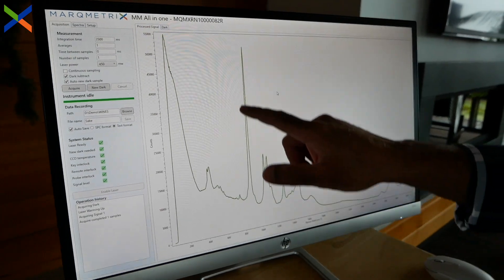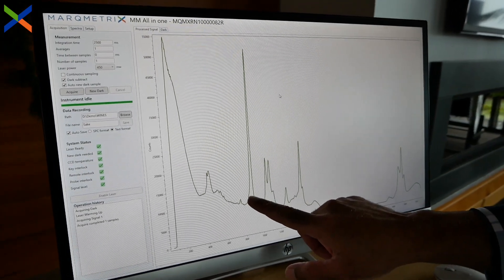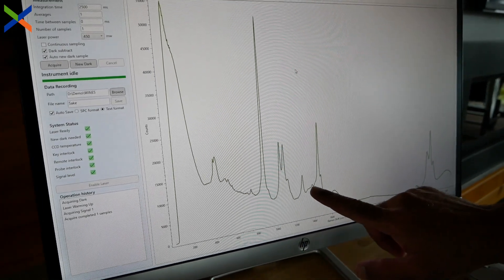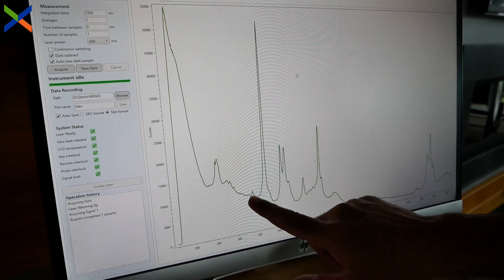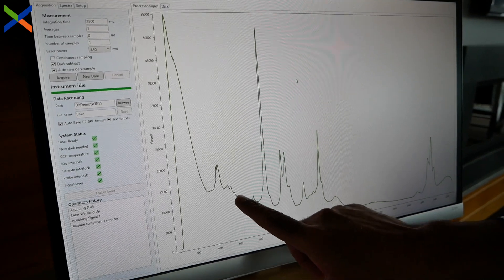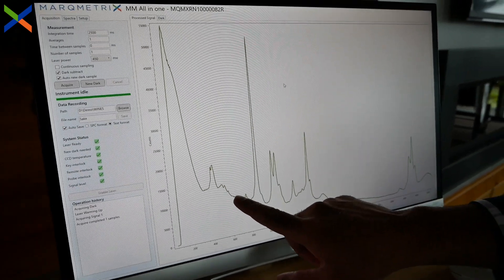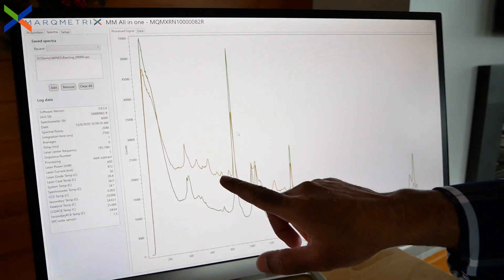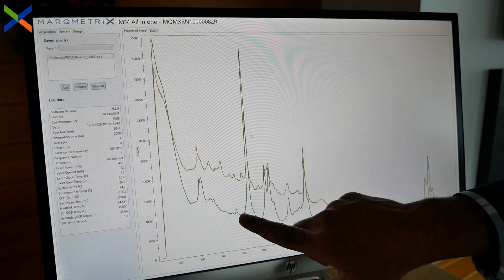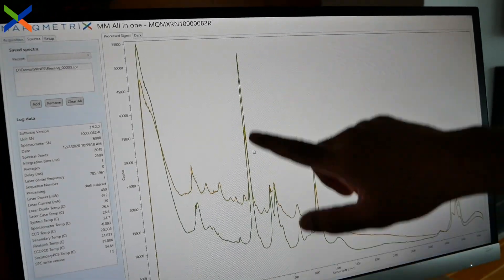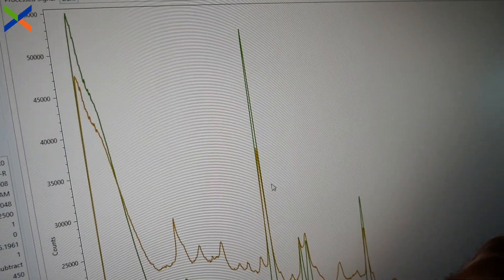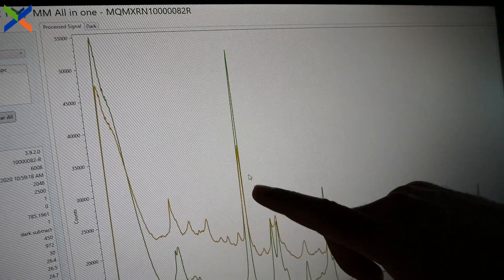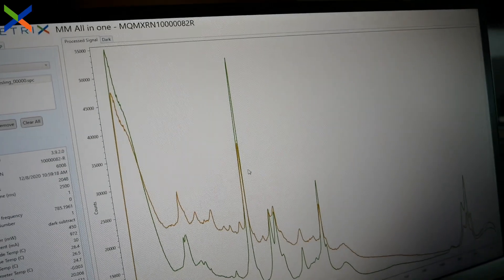Again, that peak we're seeing comes from alcohol, including some of these peaks over here. The baseline has gone down drastically compared to the Riesling because this is drier — less sugar content. In yellow is the spectrum of the Riesling, and in green is the spectrum of the sake. The highest intensity peaks that overlap really well are the peaks coming from the alcohol.